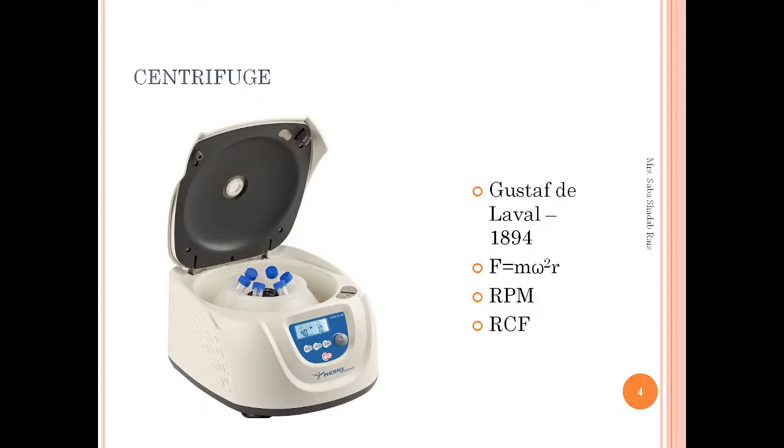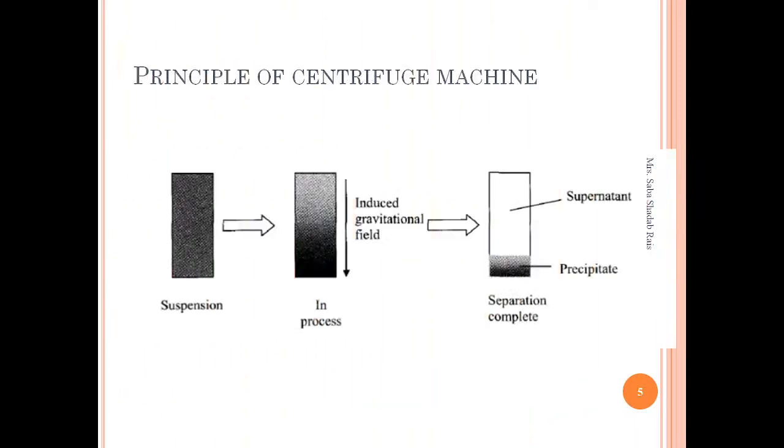On the basis of the revolution per minute, how much centrifugal force there is, on that basis the particles will be separated. So we can say that centrifugal force is a force applied on the suspension, and on the basis of that force, the heavier particles will be separated from the lighter particles in the liquid medium.